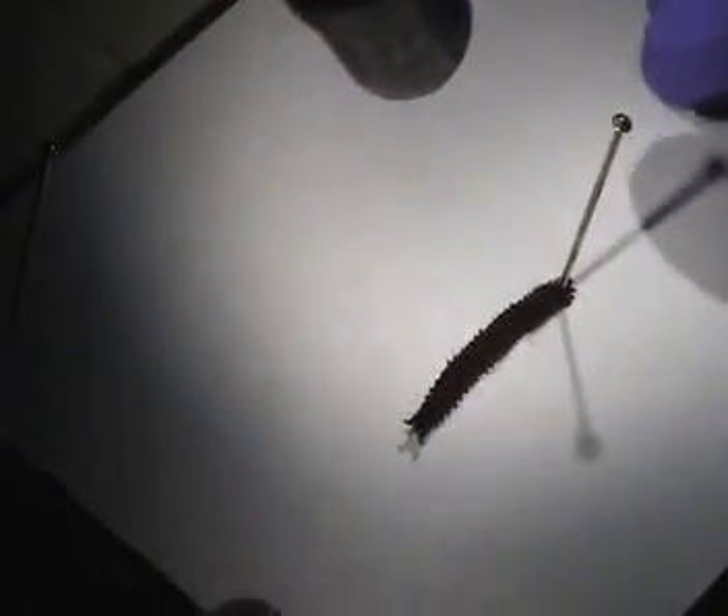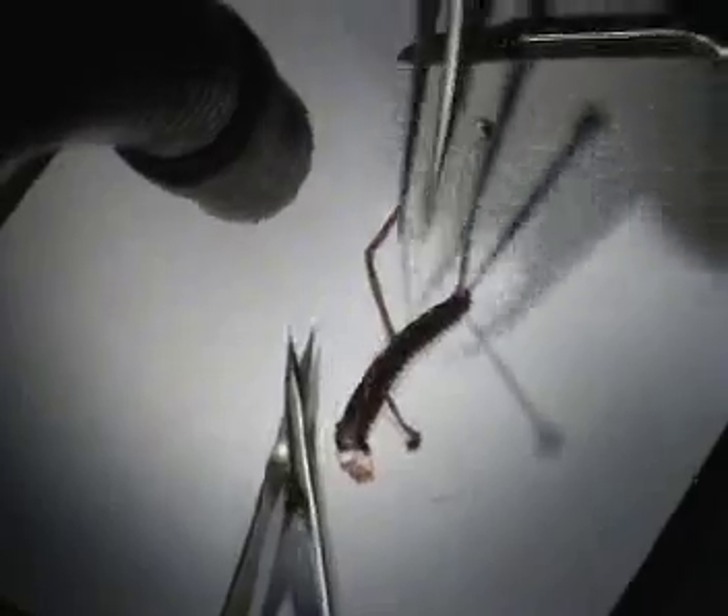That is a big one. That was really good footage I just got — as you lifted that whole thing up. That's the gut tube right there, and these are the slime glands.